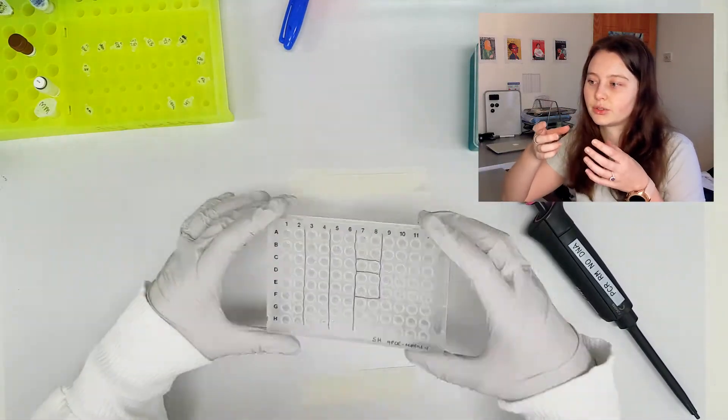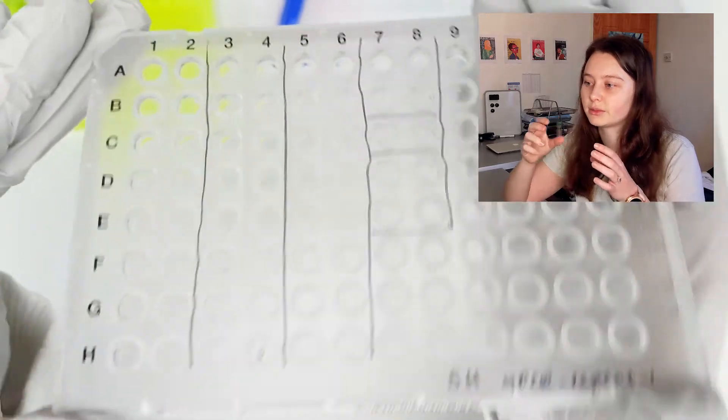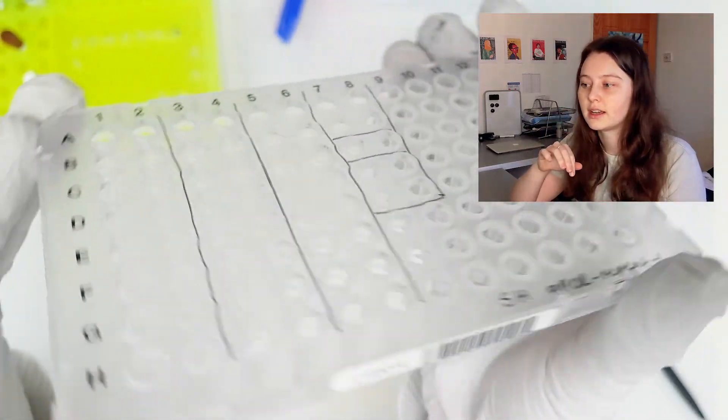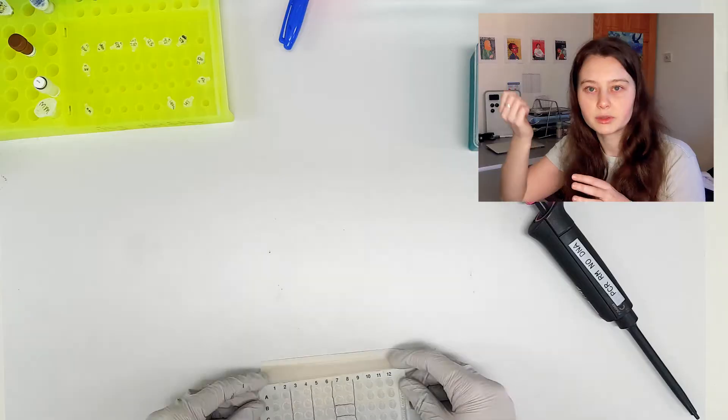So now I'm just checking to make sure that I got all the liquid inside, so I'm just having a quick look around, make sure there's liquid in the right wells, and that there's none up on the side, which would mean that I missed.